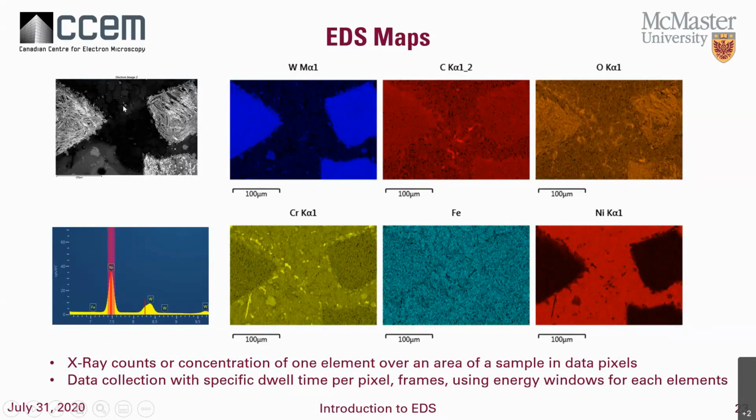So we could do a smaller area. Here we're doing the full field of view. You don't want to do mapping usually at fairly low magnifications. We run into problems with some SEMs having distortions. Also, we run into geometric problems, sometimes sample curvature and issues like that.